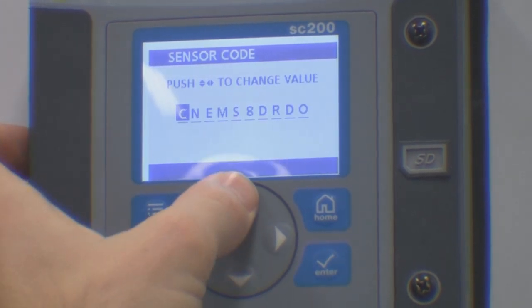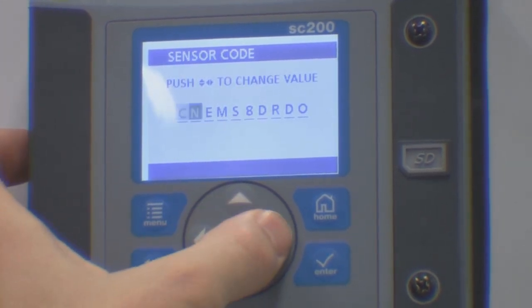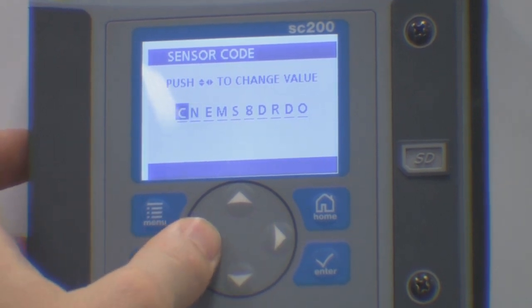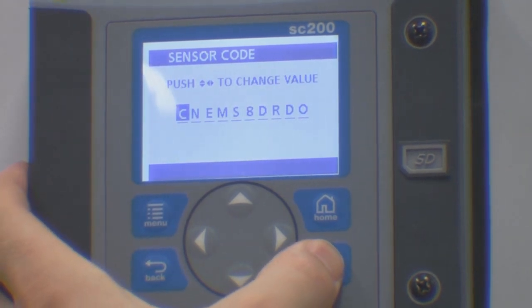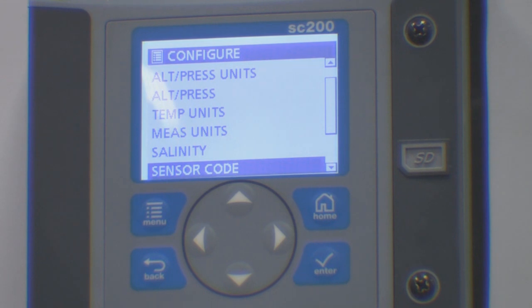Use the up and down arrows to change the character and the left and right arrows to select which character you wish to change. Once you have edited all the characters, press the enter key. Your probe is now ready for operation.